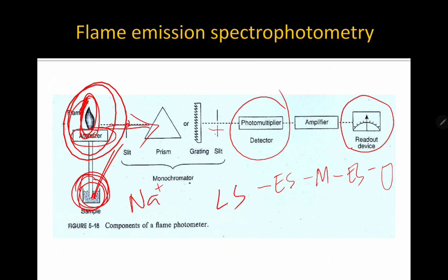Okay? So remember, sir, bakit nga ba mabasa yung sodium? Because remember, your sodium, 'di ba? Meron siyang electrons, okay? So, yung electrons na present sa sodium mo, yun yung ginagamit na excite ng flame mo, causing it to do the emission of light. Okay? So I hope na gets niyo yung gusto kong iparating sa inyo, ha.